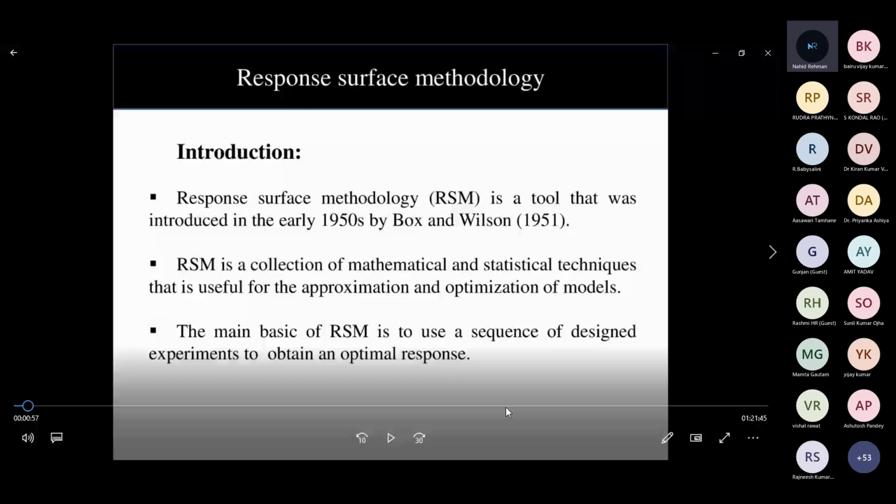Then if you want to optimize another factor which is very important, called the inoculum age. So what is inoculum here? Inoculum is the bacterial culture which you are using for your experiment. Suppose you keep all earlier parameters at the optimum, you vary only the inoculum age in all the experimental setups. Then you find out how much you are getting. Suppose an 18-hour-old culture is giving you the best hydrogen. So now you have fixed temperature, you fix pH, you fix substrate concentration, and then you fix the inoculum age.